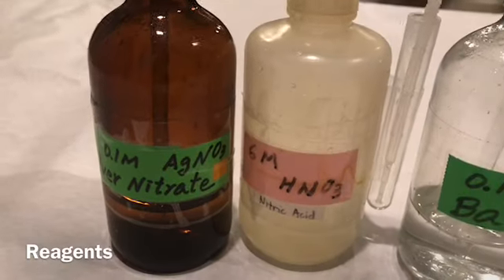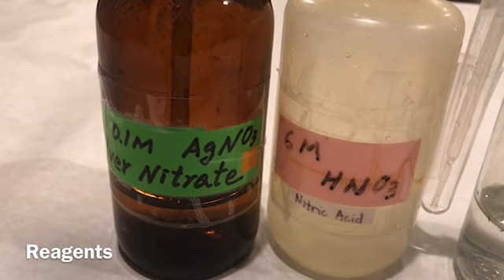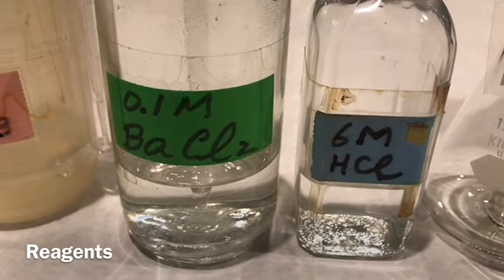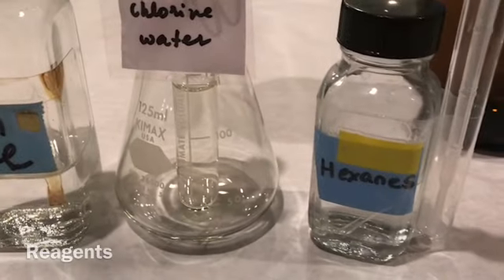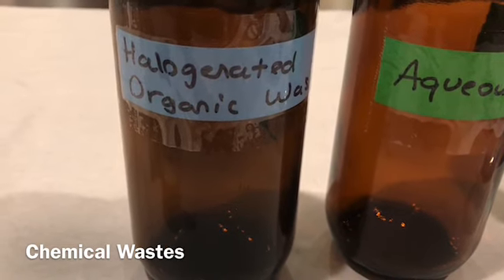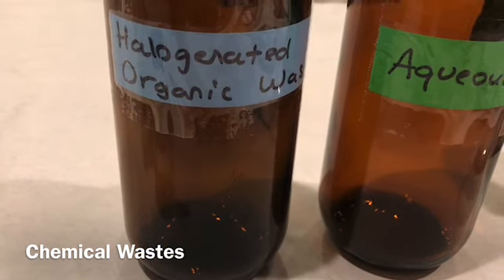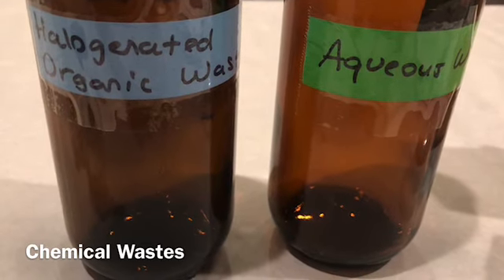Okay, now the reagents for the 3 different tests. For the silver nitrate test, we would need 0.1 molar silver nitrate and 6 molar HNO3. For the barium chloride test, we would need 0.1 molar barium chloride and 6 molar HCl. For the chlorine water test, we would need chlorine water and hexane. And these are the waste containers. For the chlorine water test, we would need the organic waste, the halogenated organic waste actually, because we are going to use halogens in that. And then we would need the aqueous waste for all other tests.